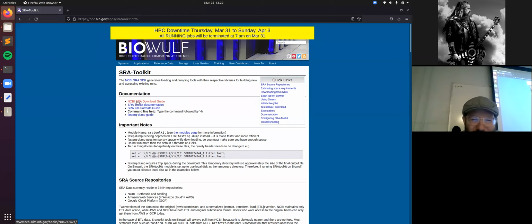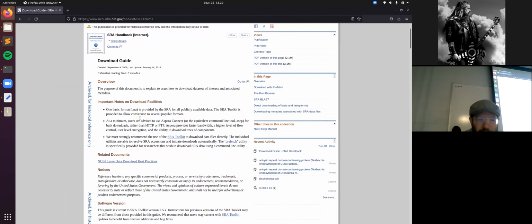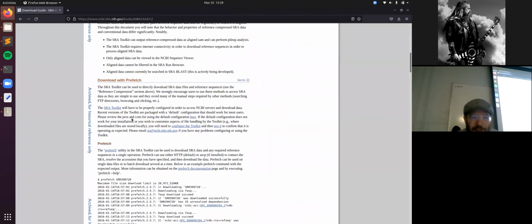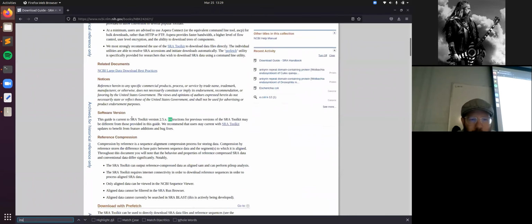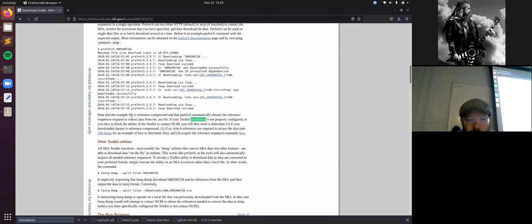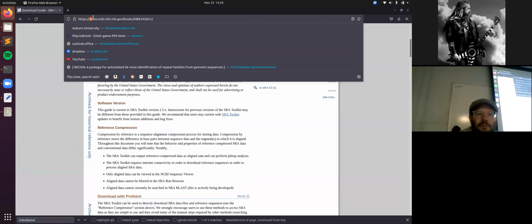Now this is where the dumpster fire will really start. But it is good in a sense, because when I Googled that, you're seeing a guide, and that's always where you start. There's always going to be install instructions, and you have to look at those. Let's see if I can find them. I was lucky in using this because we're running it all on the Algebra supercomputer. I already have it, so you just have to load the modules and stuff. So the setup time for that is really different than downloading it and setting it up yourself.